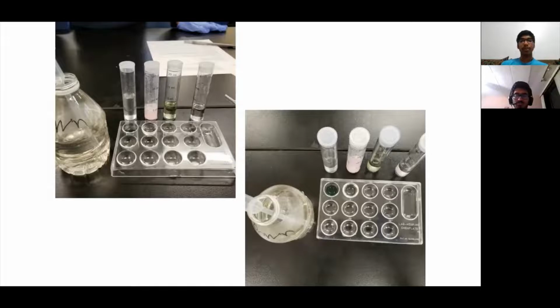And for phosphorus, the green color is darker in this sample, so that means that there's greater phosphorus presence. And the sulfide sample, even though it looks clear, in the beginning it had turned blue for an instant, which means that a small quantity of sulfide was present in the test.